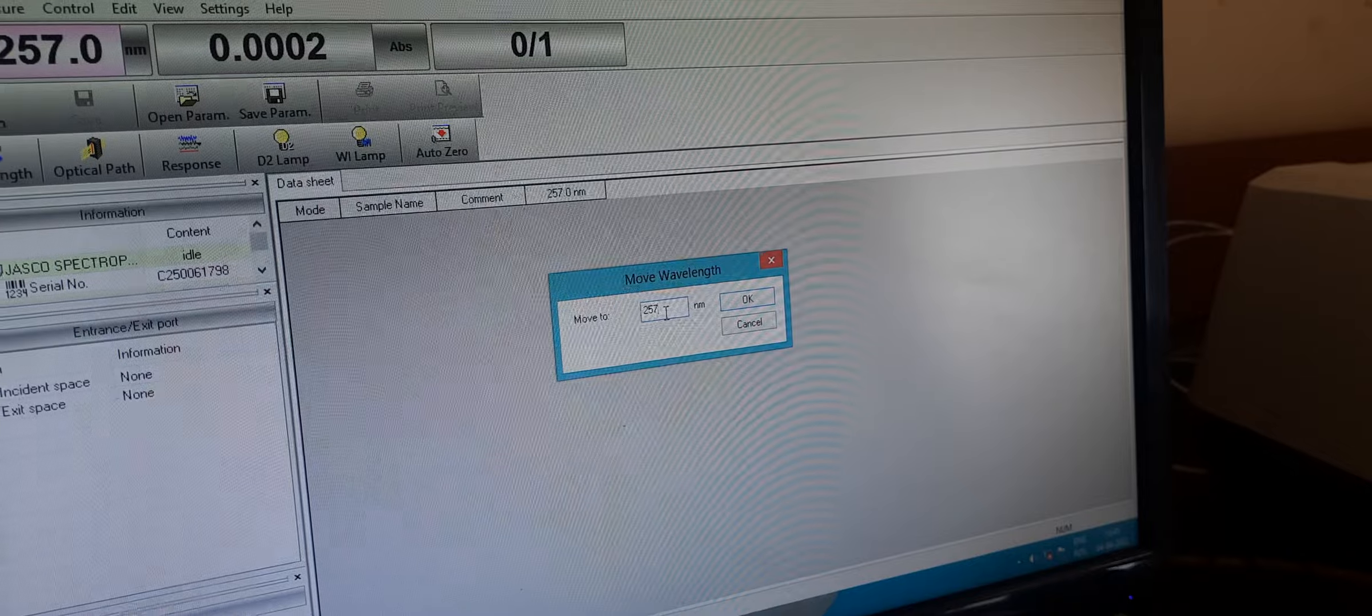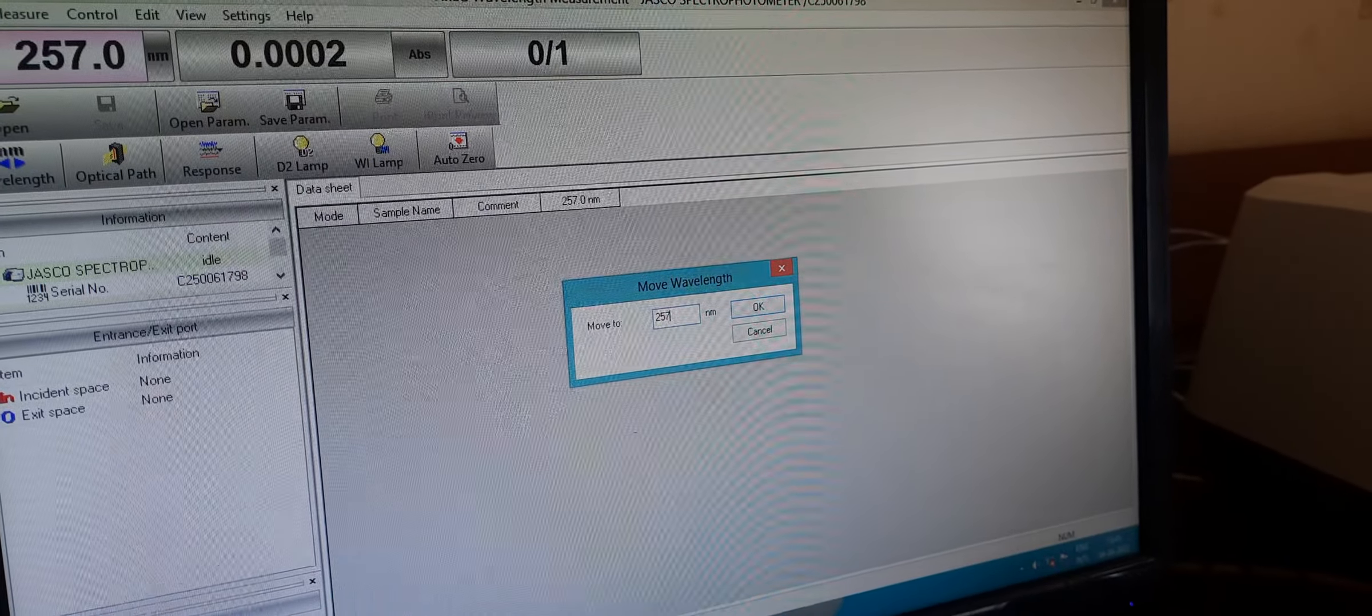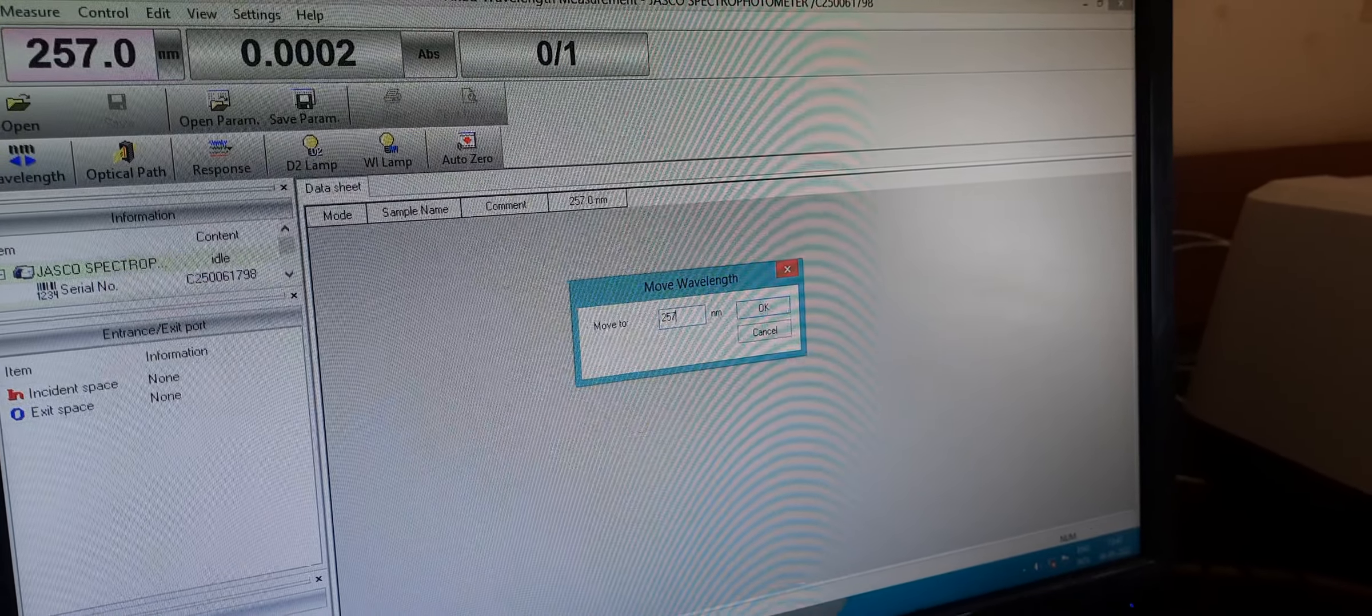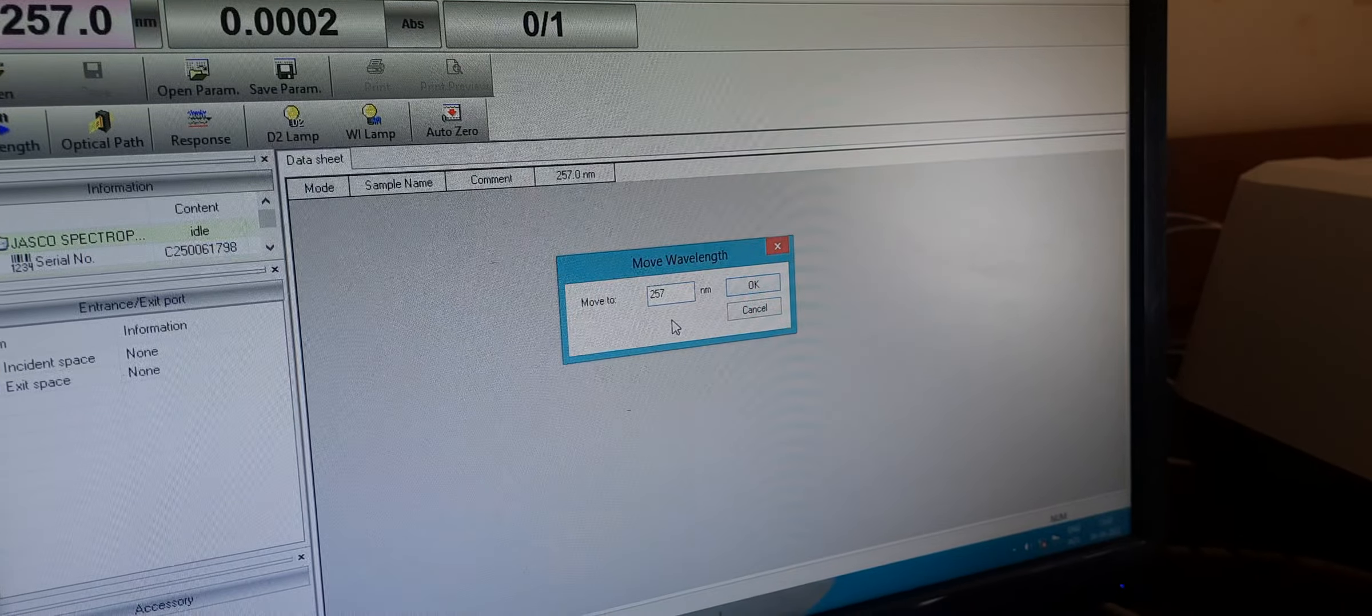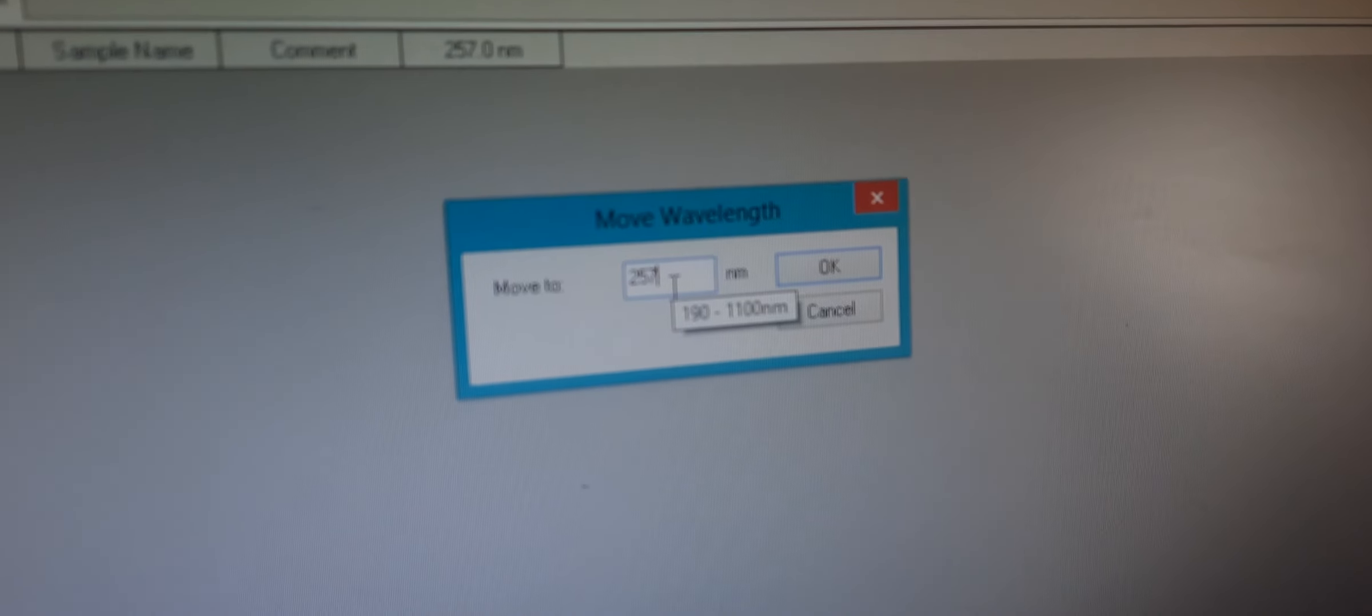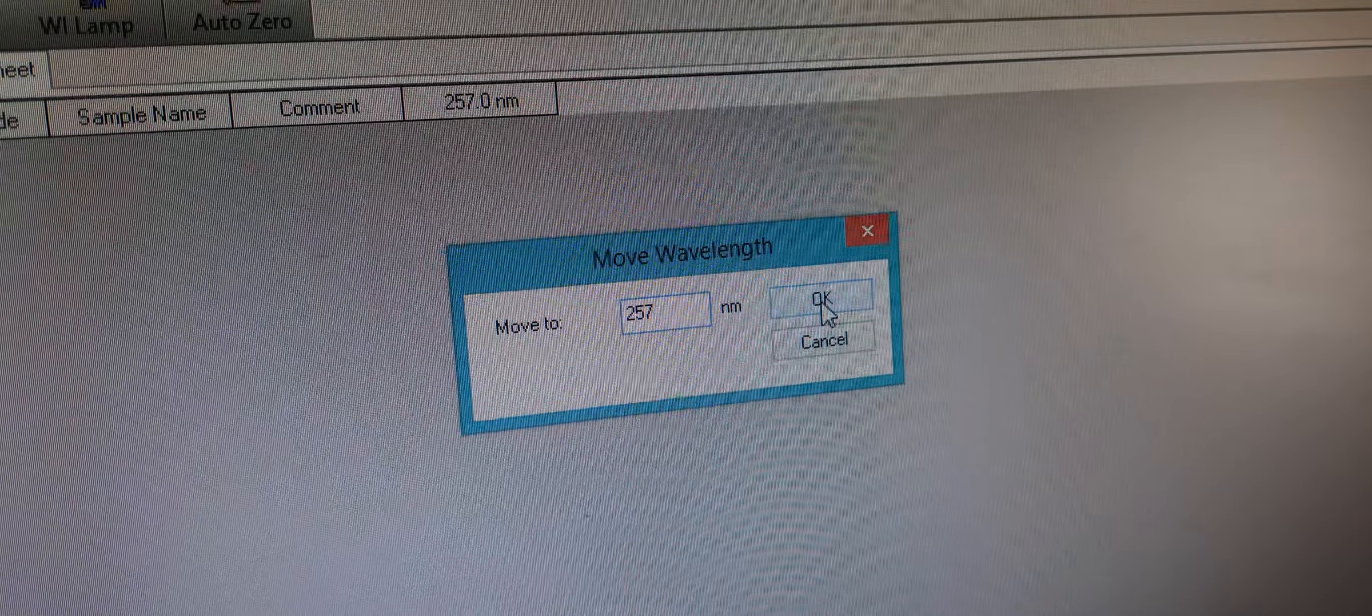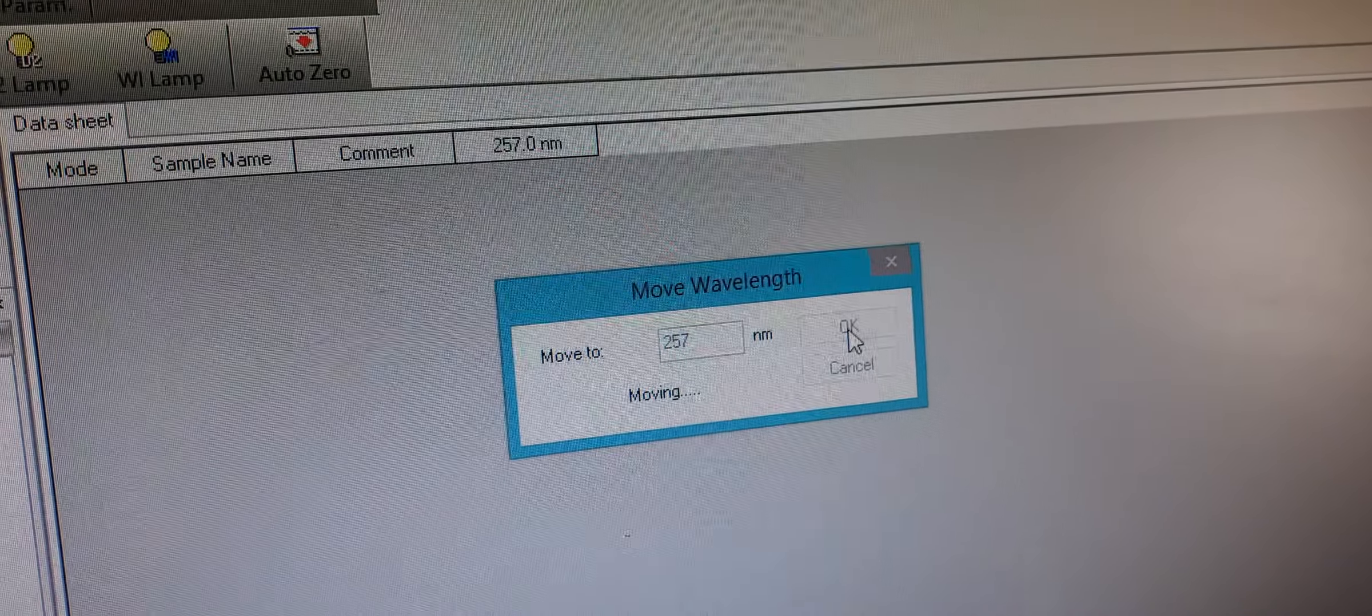The wavelength of paracetamol is 257 nanometers. Then click the OK button.